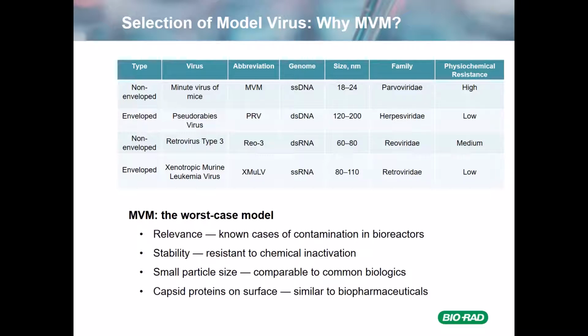MVM has been considered the worst case model, and for several reasons. First, there have been known cases of contamination in bioreactors, so it leads to relevance of this virus. Second, it's very stable, so it is resistant to chemical inactivation.